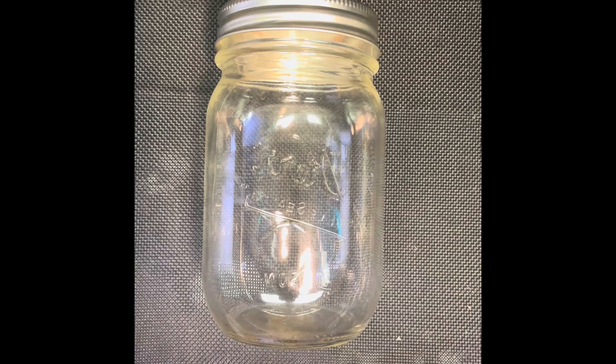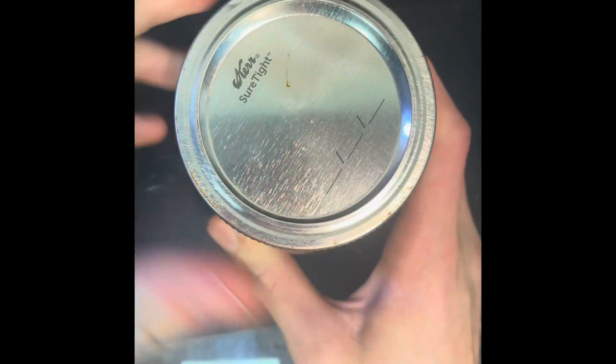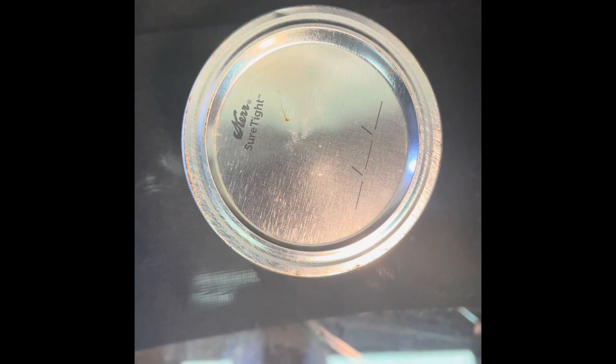The first step: you want to add the 500 milliliters of water into your jar. Screw on your jar's lid and put the jar into boiling water for about 10 to 15 minutes.